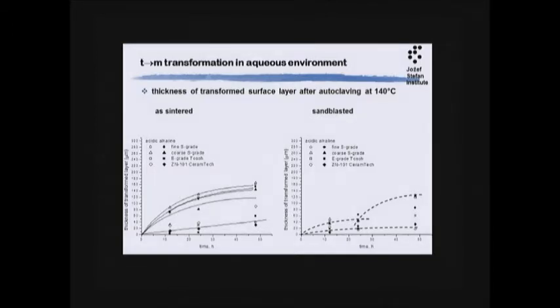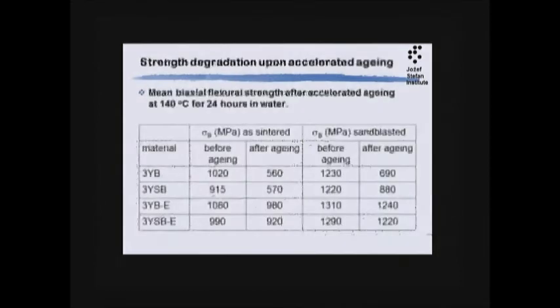I skipped that. And it's interesting when we check the sandblasted. The sandblasted material will transform a little more slowly than this one. So initially, sandblasting certainly hinders the aging. Those were the first results.